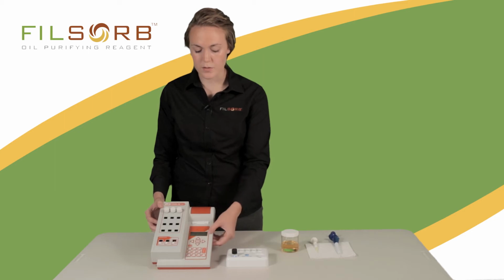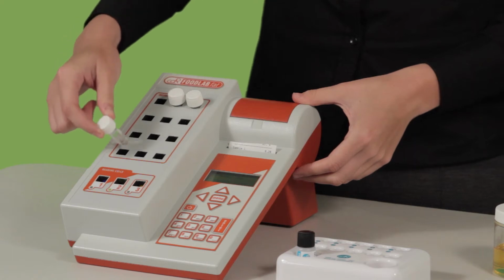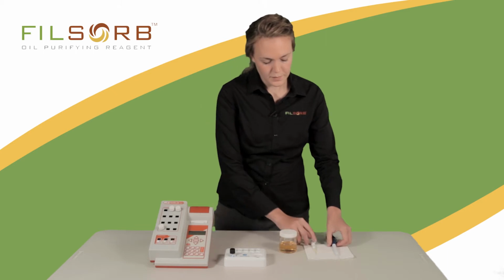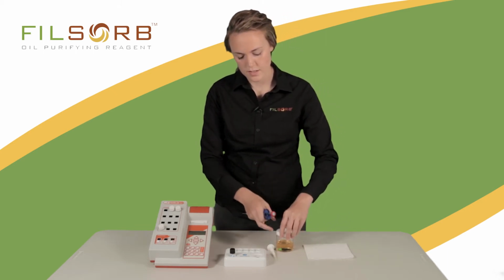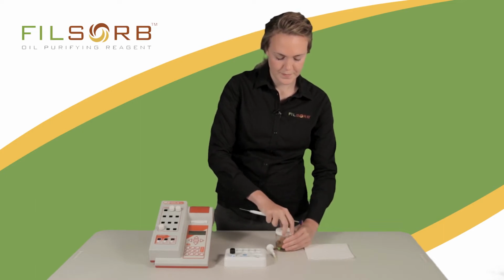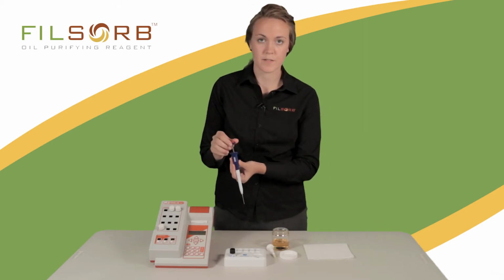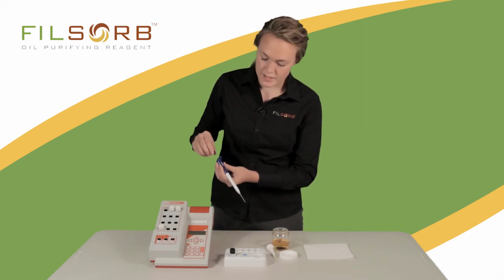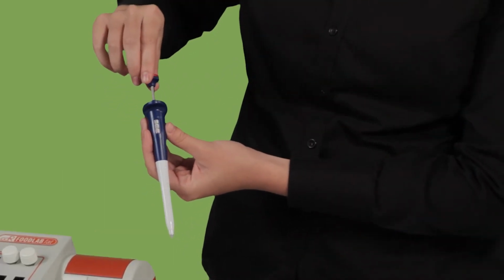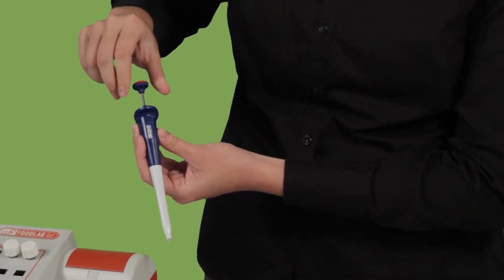At this point, the screen will show incubate for 3 minutes. Before you can incubate, you'll need to add your oil and your reagent number 2. You're going to want to make sure your pipette is reading for this curve that you selected. We selected curve 10, so we make sure our pipette is reading 10.